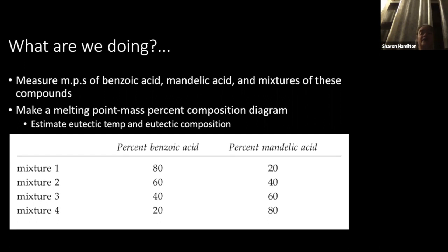If you don't actually get a point where those two lines intersect in kind of that V nature that we saw earlier, you can postulate and sketch out what the trajectory of your actual lines would be.